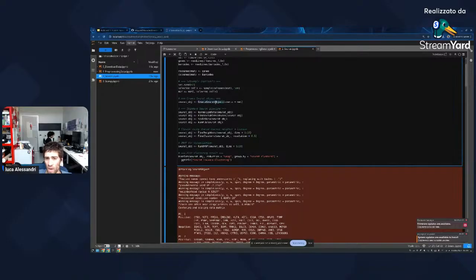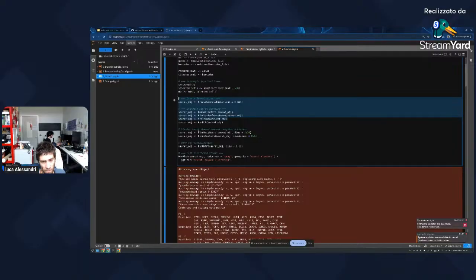And then I create the Seurat object. Then I normalize the data, find the variable features, and scale the data. These are some command lines that you also saw last time when it comes to normalizing data and filtering. Here I put basically the standard pipeline for Seurat.